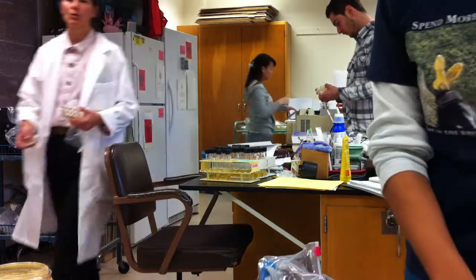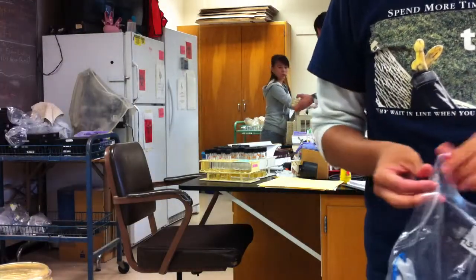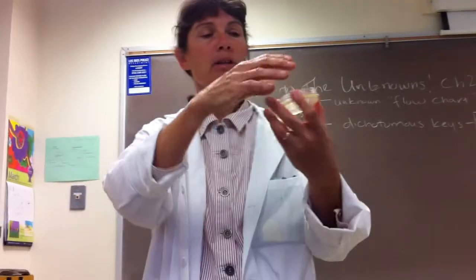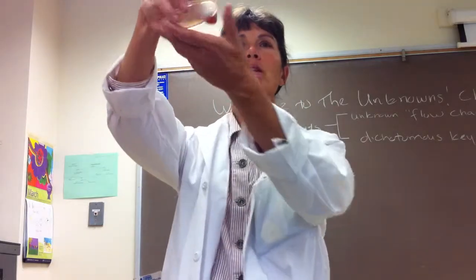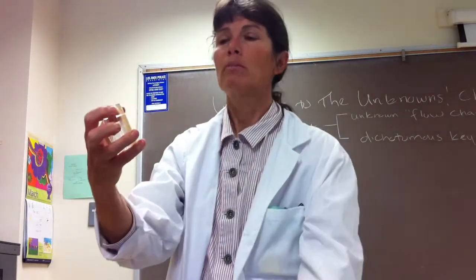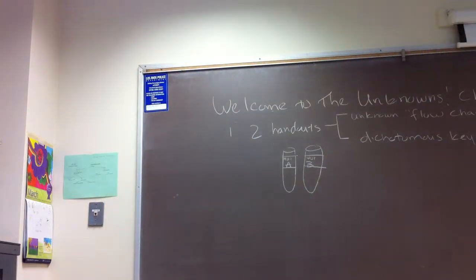I should have told you all. You guys, please listen up on this one. This is really important. Whenever you're coming up and getting plates, if you accidentally open the lid, please don't use it and don't put it back. Just come over here, grab one of the markers and put an X on the bottom and just put it here on the desk.